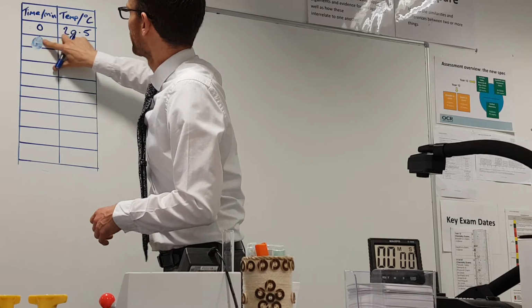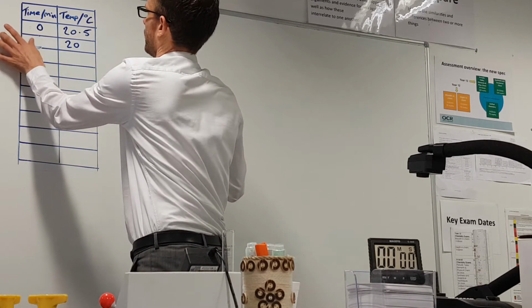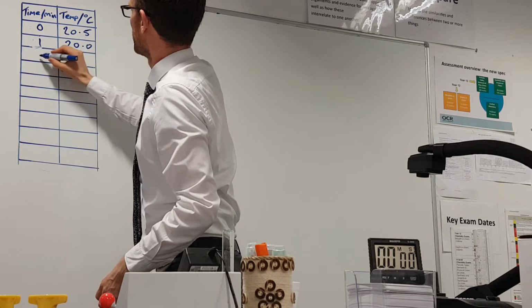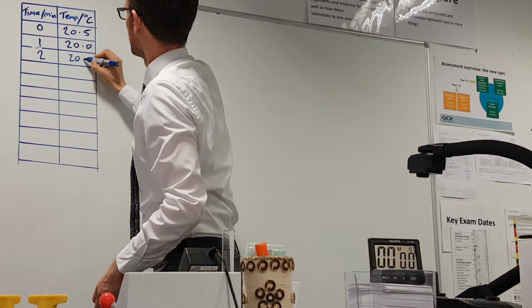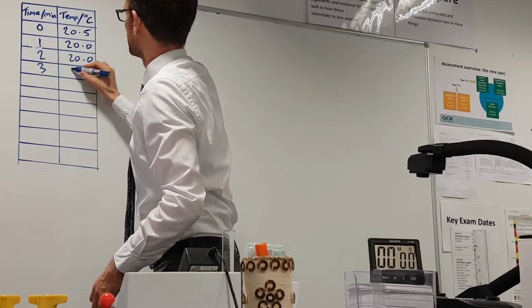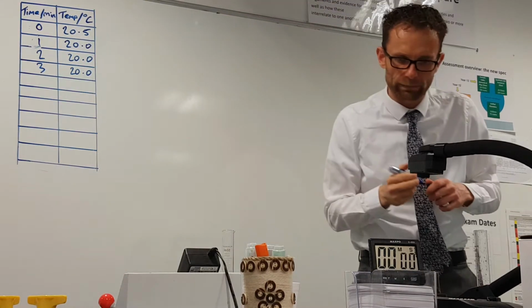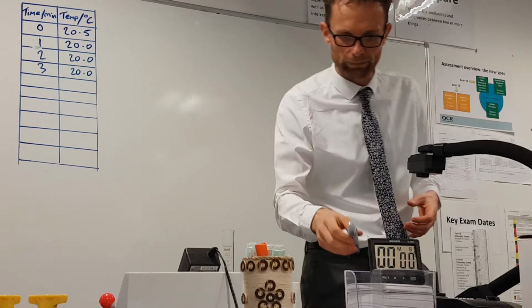Sorry, not naught. After 1 minute, it's 20.0. 2 minutes, it's 20.0. 3 minutes, it's 20.0. Okay, and so it's settled down to a constant temperature.